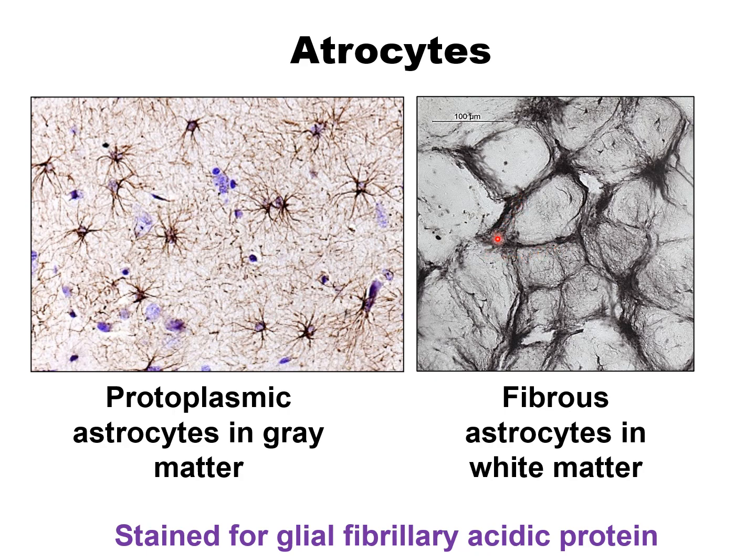So these are the fibers of the fibrous astrocytes, the stained areas. The unstained areas are the neurons. As they support the neurons, that's why they are present around the neurons. But more fibrous astrocytes are present in the white matter.